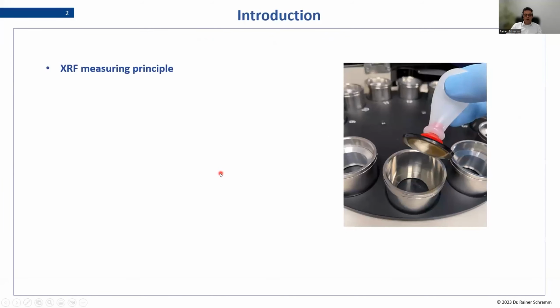First, we have to talk about the XRF measuring principle, to understand why it is possible to calibrate an XRF and why you can use it standardless. How does it work? This is very important. Unfortunately, I have to go a bit deeper into mathematics to give you a basic understanding of how the mathematics works and what the consequences are, so what parameters you have to influence so that your results will still be accurate.